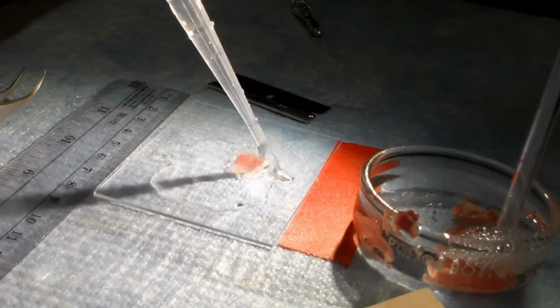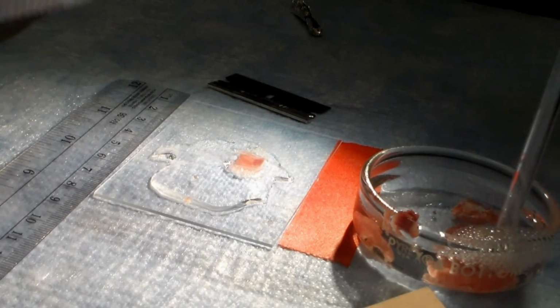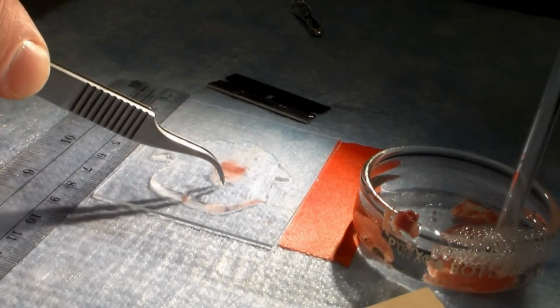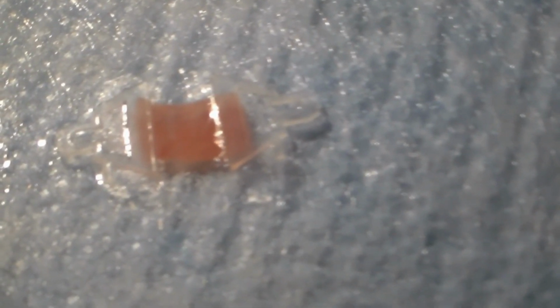And then we'll put this slice back into the solution. Sometimes it's advantageous to just make sure that it's not glued to the glass surface. Here's a close-up of the final product. You can see how the clips have been glued onto the ends of the rectangular shaped slice.